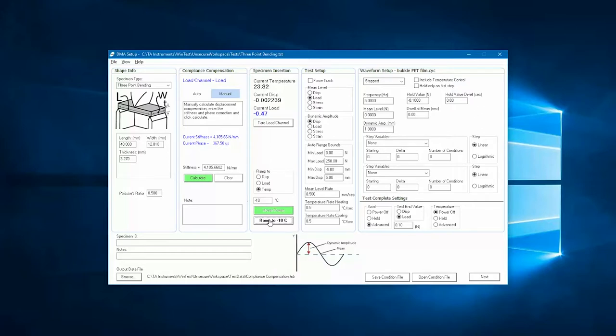However, if we close the initial gap with a displacement command, the controller will maintain a fixed position, potentially overloading the sample or losing contact with the sample while it undergoes thermal expansion or contraction.